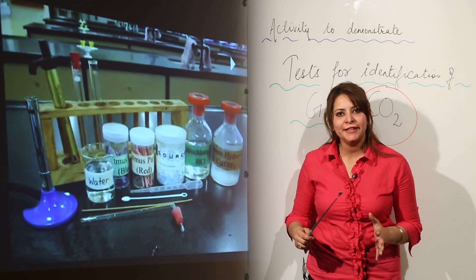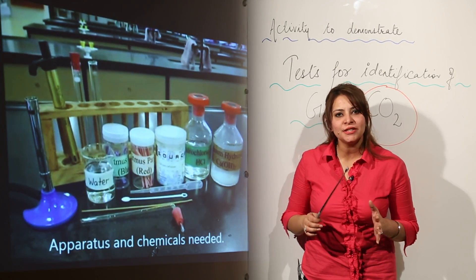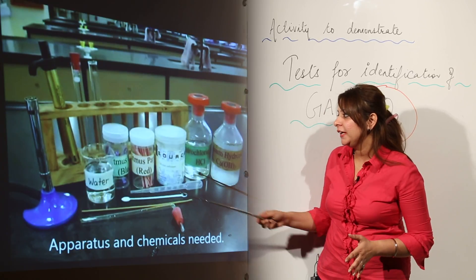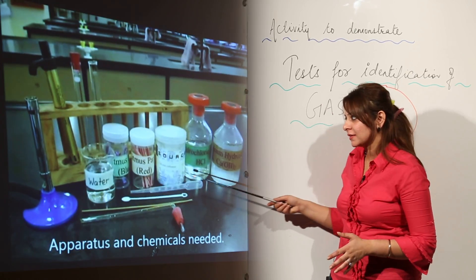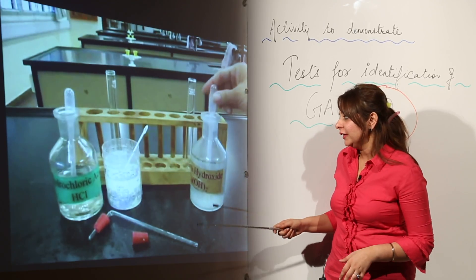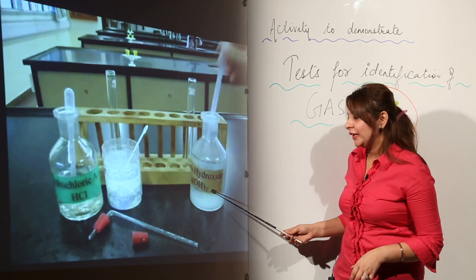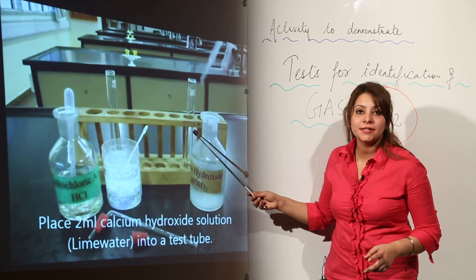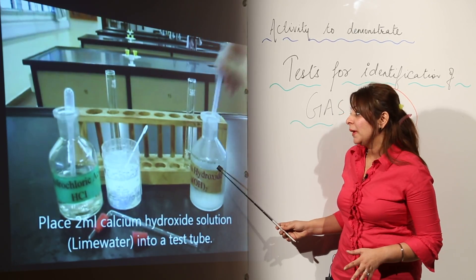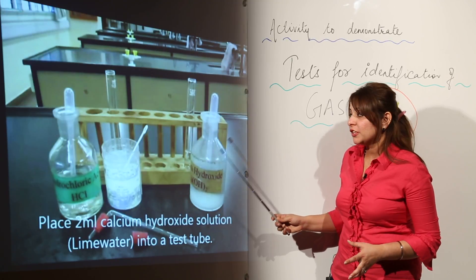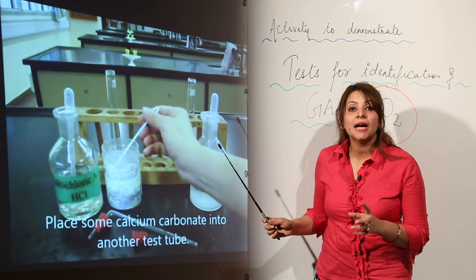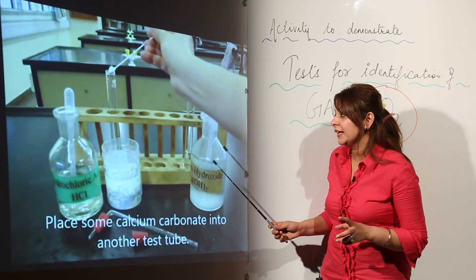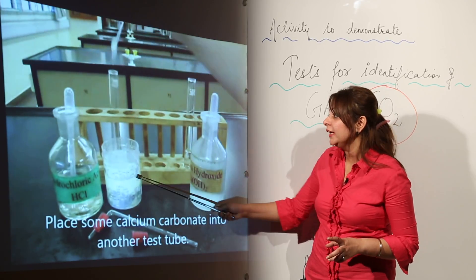We are going to study the identification test for the gas carbon dioxide. For this we'll be needing all this. What we have here first is calcium hydroxide — that is the slaked lime — which we are pouring into a test tube. To show the reaction, we first need carbon dioxide, so we are in immediate need of it.